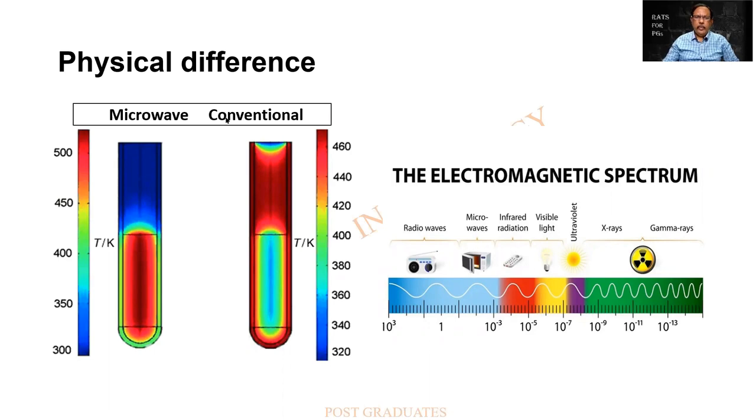And look at this picture over here that has been retrieved from the net. The difference between the microwave and the conventional. In the microwave, there is a tremendous amount of energy that is created in the core that dissipates outside. Therefore, the entire specimen or substance gets heated uniformly. Whereas in the case of a conventional processing, you find that the energy is from outside and it takes time to get penetrated to the core of the tissue. This is a difference you people can bear in mind.